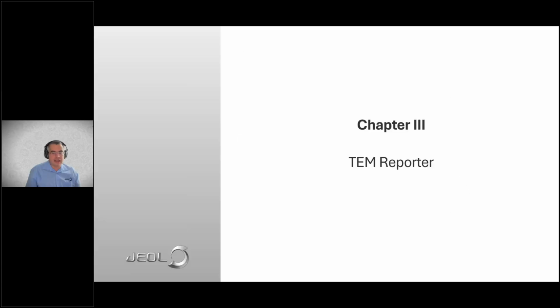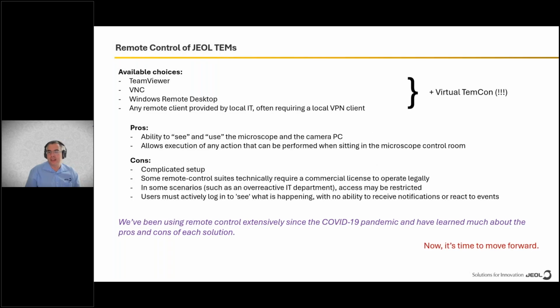Right. Another cool thing that I want to talk about is called TemReporter. TemReporter was developed using the Virtual TemCon experience and by trying to port this experience to a mobile phone. The disadvantage of Virtual TemCon or TeamViewer is that you've got to log in, you've got to find the right options, you've got to spend time on doing this.